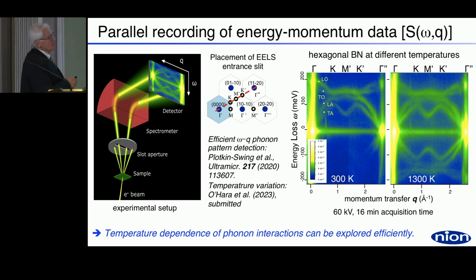on the sample. So when we have good momentum resolution, we have to give up spatial resolution, uncertainty principle. You can't have infinite spatial and momentum resolution at the same time. But to get this kind of angular momentum resolution, a 3 nanometer probe on the sample will do it. So we still have spatial resolution. We can probe defects like this.